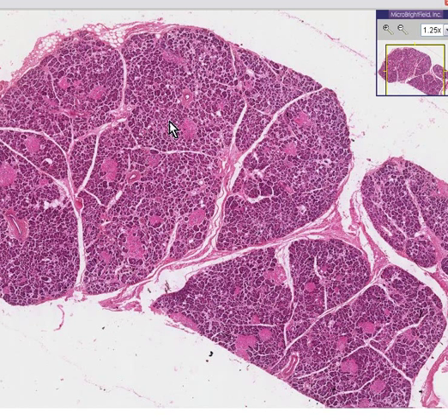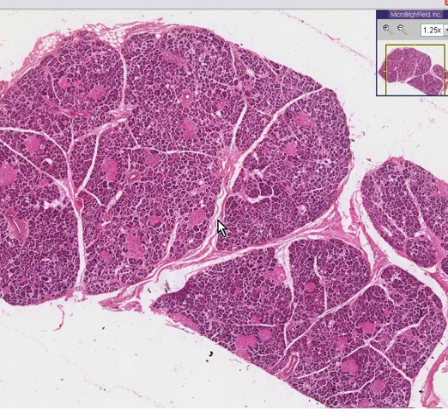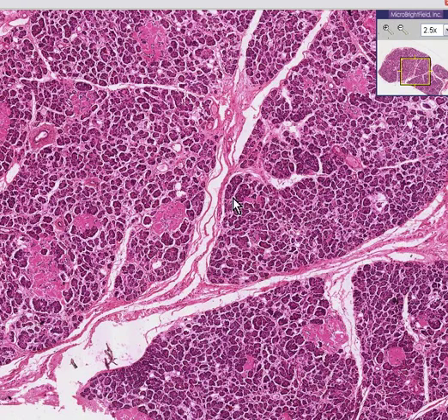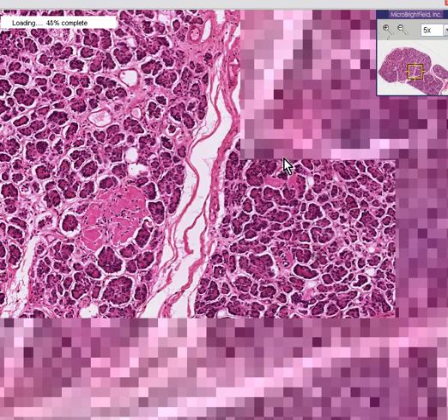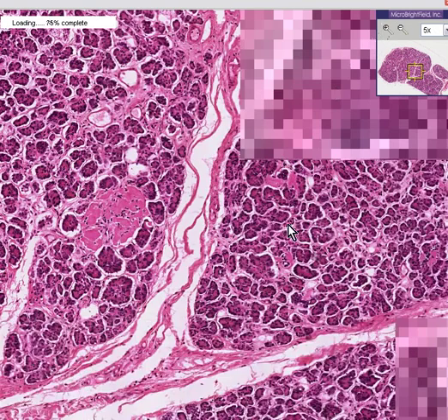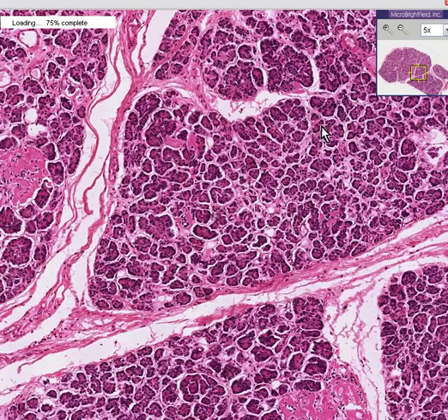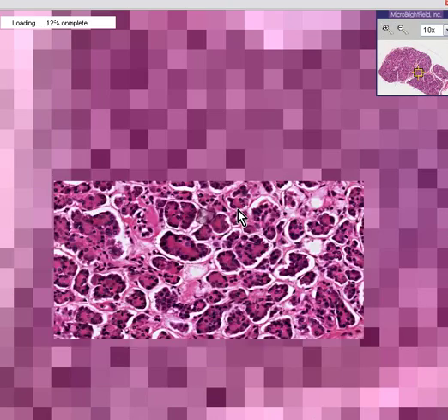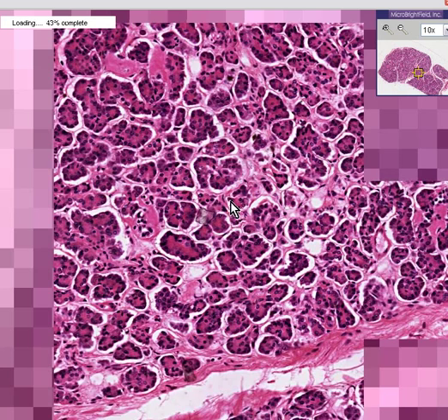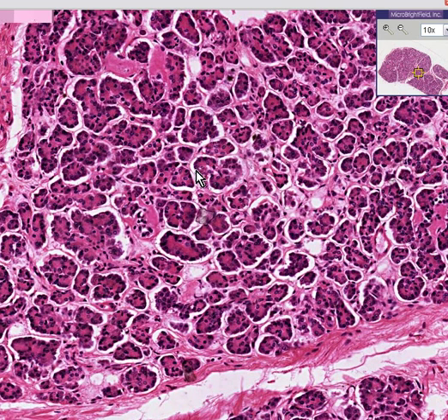Here is a mysterious organ. It appears to have lobes and lobules and connective tissue surrounding little glandular areas. That makes it a classical exocrine type of gland, doesn't it? In fact, this is a pancreas.